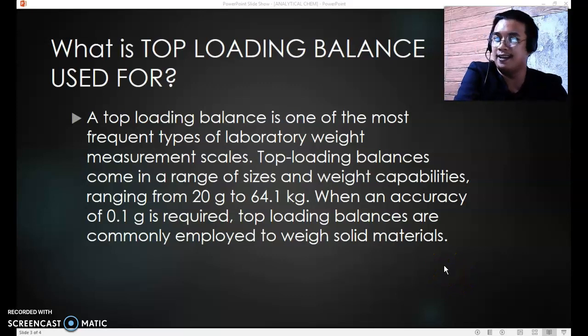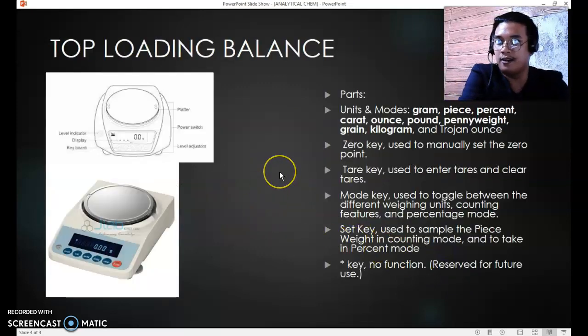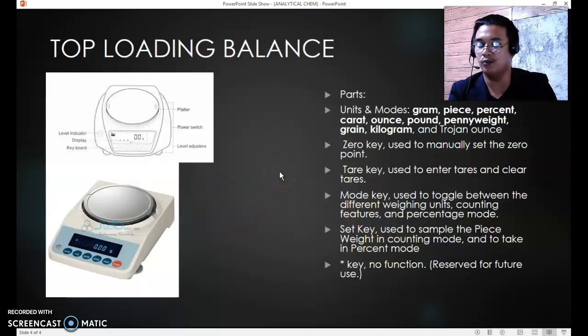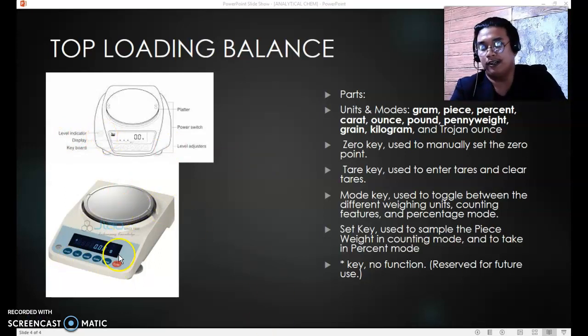So next, here I'm showing to you what a top loading balance looks like. At the lower part is what the top loading balance looks like.